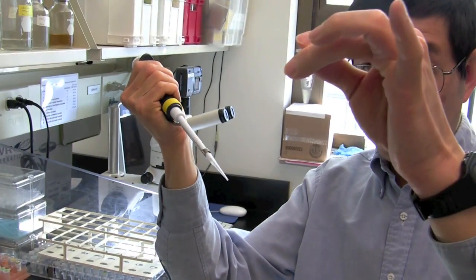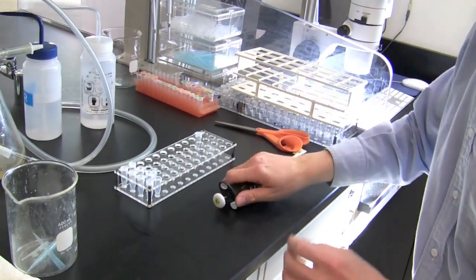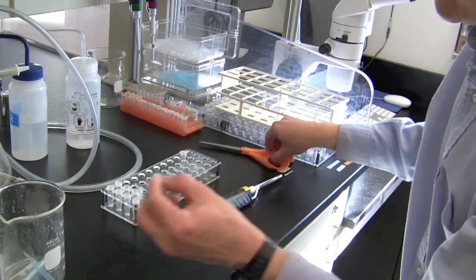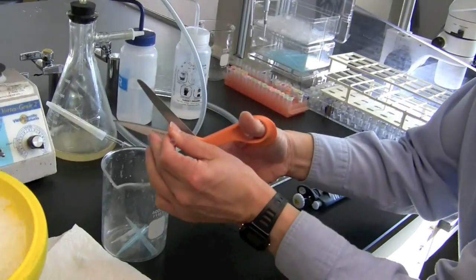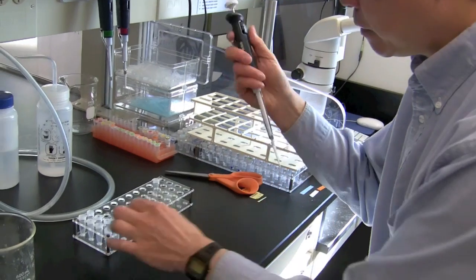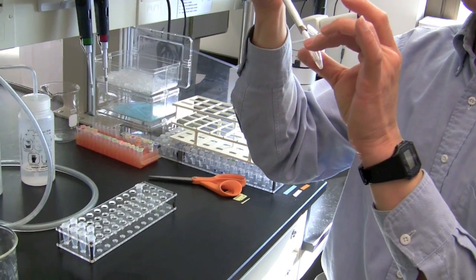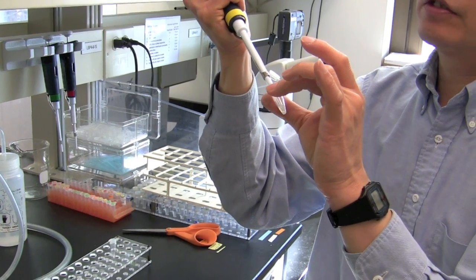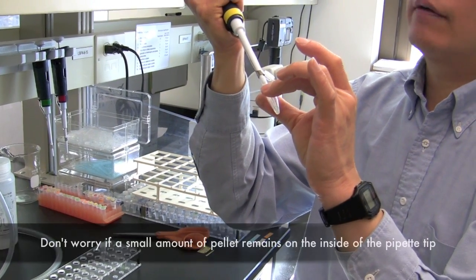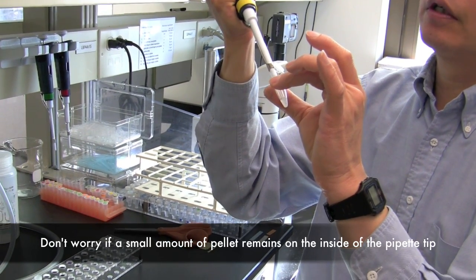So that's the resuspended sample. That's sort of what it usually looks like. And I need to do this now for the second one. Same idea. I'm going to cut off the tip to have a wider opening. And then I'm going to resuspend by pipetting up and down, blowing at the pellet, and actually trying to grab onto the pellet so that as it travels through the tip, it gets broken up and then dissolves.